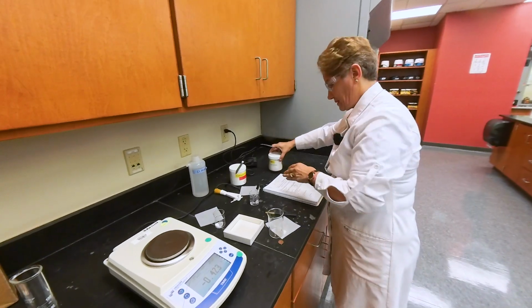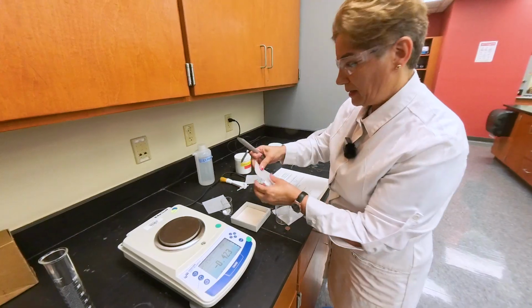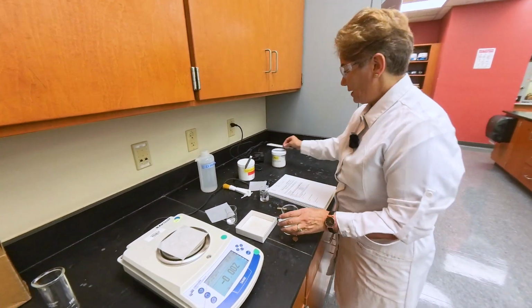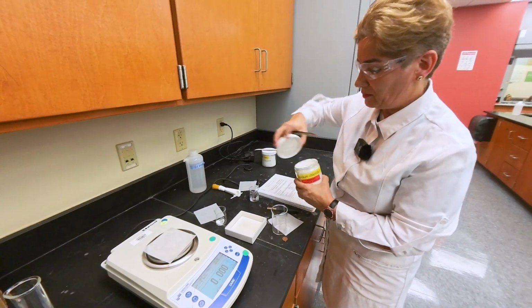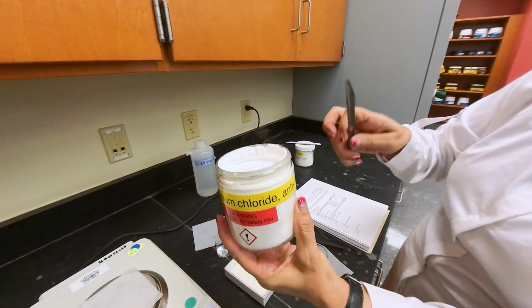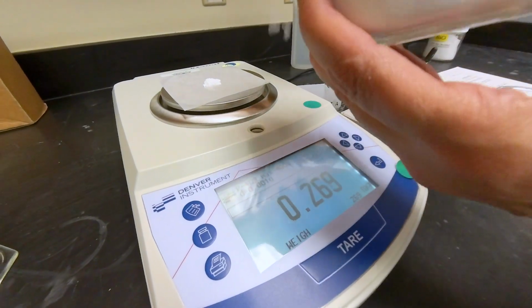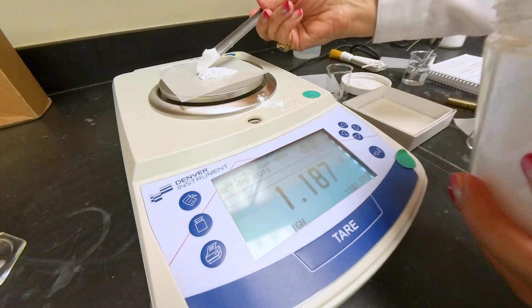Next one is measuring 5 grams of calcium chloride. Now, again, this is measuring out. I do not need the mass of the weighing paper. Make sure it's tared and it shows 0 to begin with. Take the calcium chloride anhydrous and start adding 1 spatula at a time until it shows 5.00.